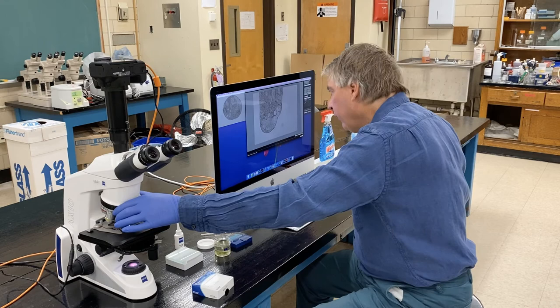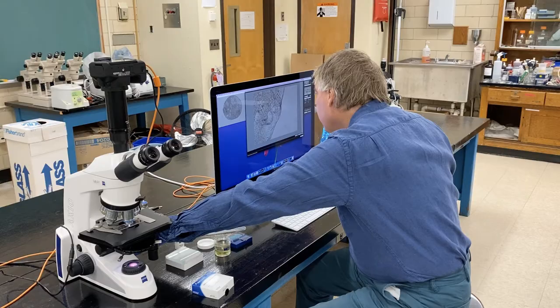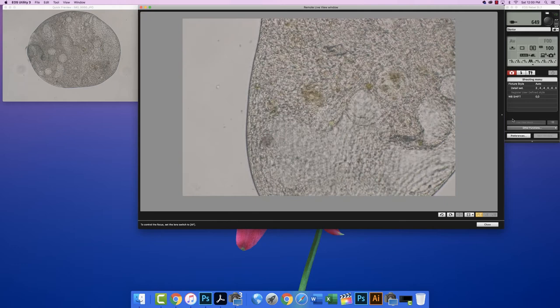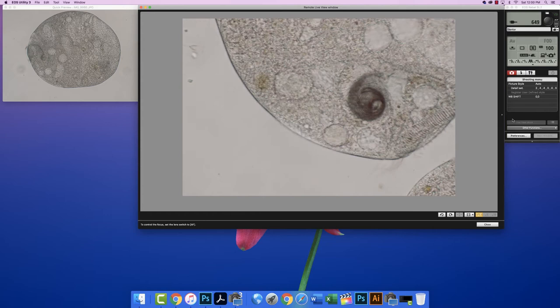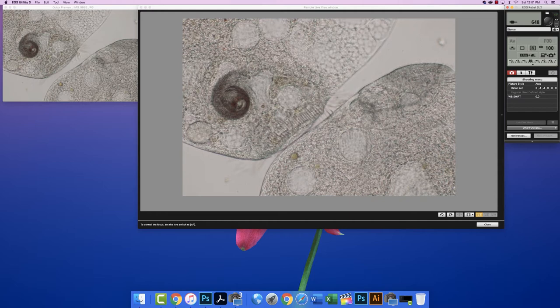And now if we move to 40x and focus, you have to start to decide what part of the critter should be in focus, because the depth of field is very shallow at 40x, and the organisms, oh, here's another, a new friend. It came by. It's a cool structure there. Little kiss.